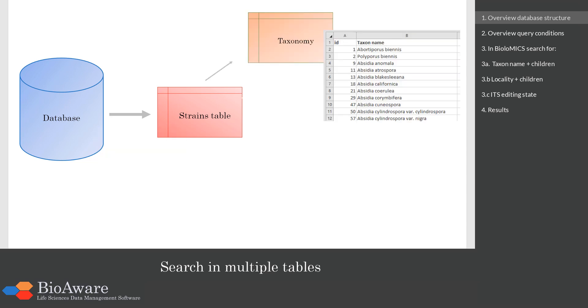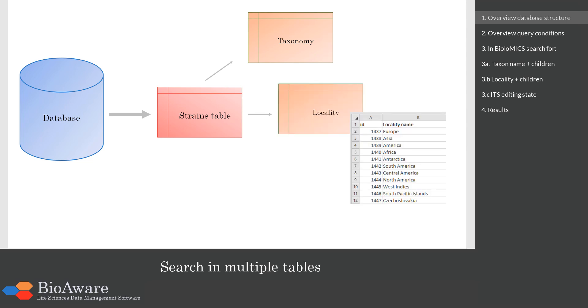The strains can be connected to a taxonomy table where we have a list of all the taxonomic names. The strain can also be connected to a locality table where we have one record for each of the localities.